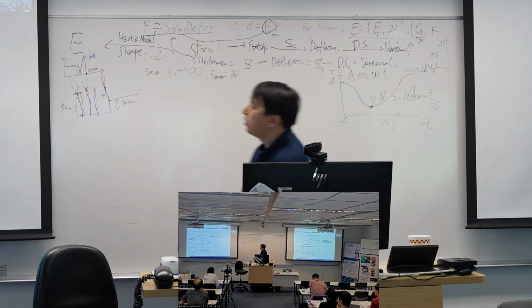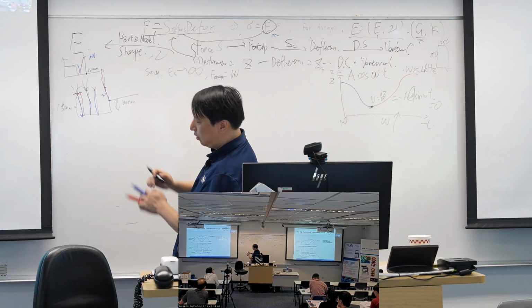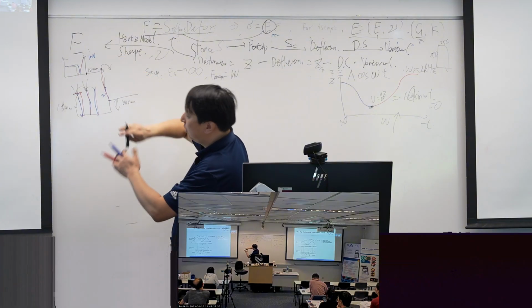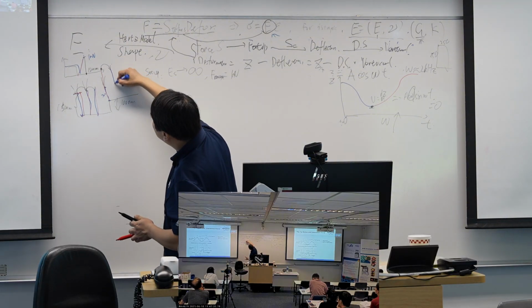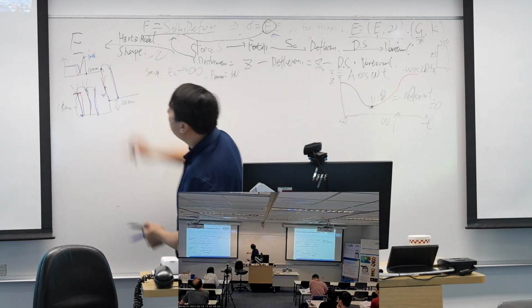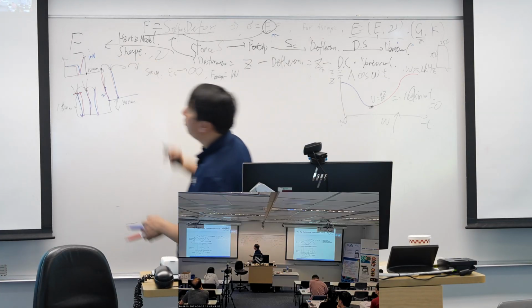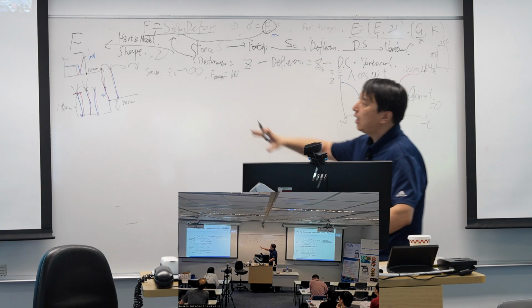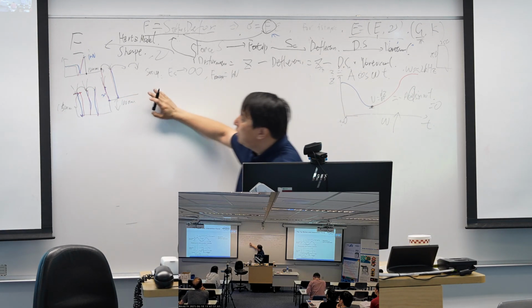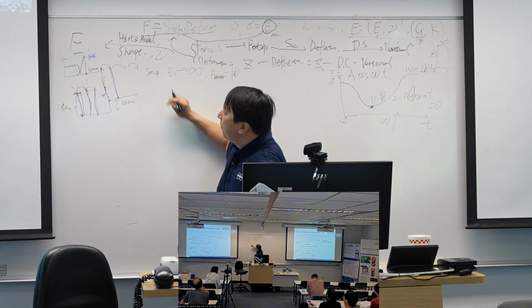So the probe will go here, and the distance over here is 150. So my probe is here. Now it will jump. It again goes up 150, goes up 150, and then keeps going up. And finally, I did many force curves on these steps. And then I get my idea, which is next.